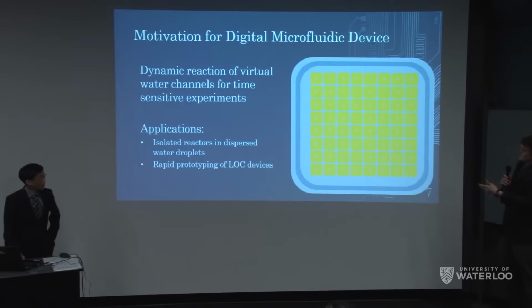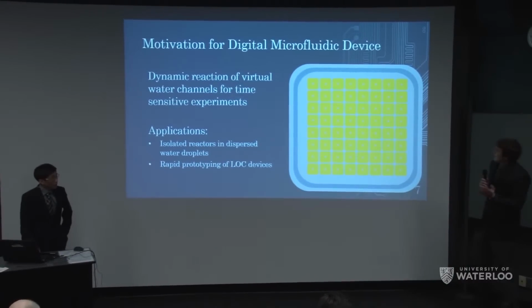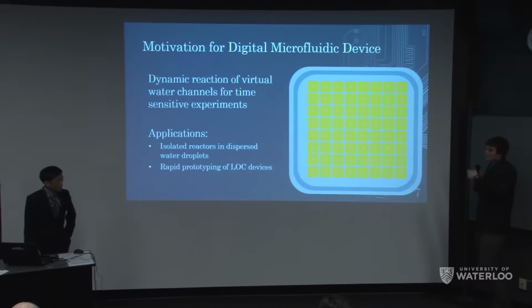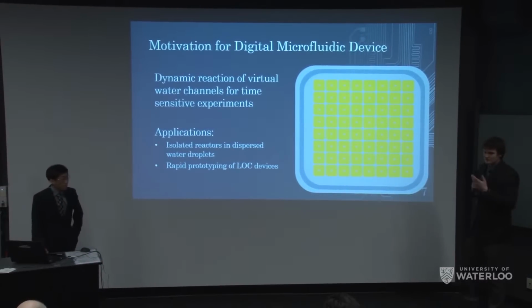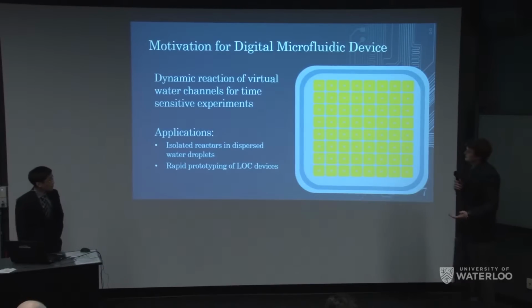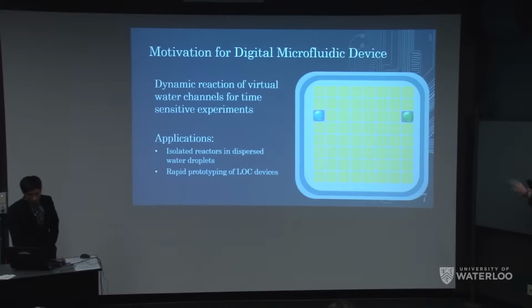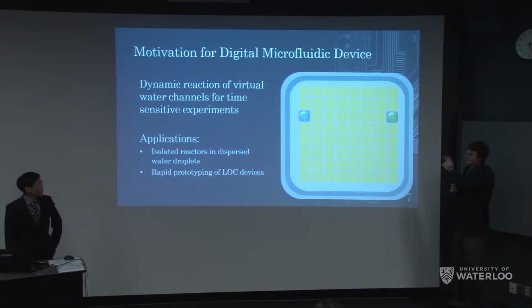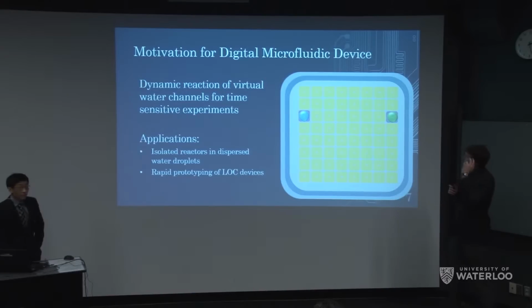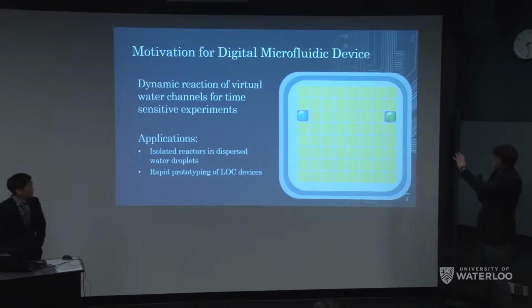As on the last slide, if it was immersed in a silicone oil, which was actually uncured PDMS, and we were to add a curative to that, holding it and applying heat, we would end up with a substrate with a customized channel embedded. An alternative application is that we don't add a curative to the PDMS, and we have a droplet on the left and a droplet on the right. Within the droplet on the left, let's say there's reactant A and reactant B. Maybe this is even a two-step reaction. And with our device, with our interface, we are able to control these individually and at the same time.